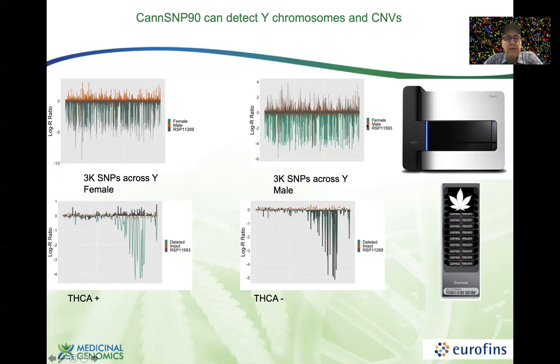That's like shooting fish in a barrel. How about the smaller regions? What about THC synthase, which is really only a 2 KB region of the genome? Can you pick up that copy number variation? That's really small. Well, in fact, you can see that listed here.